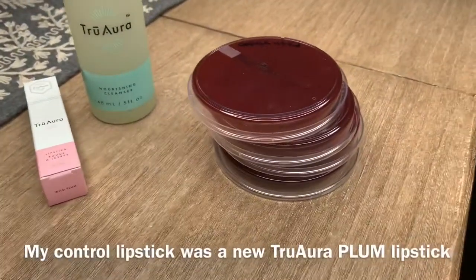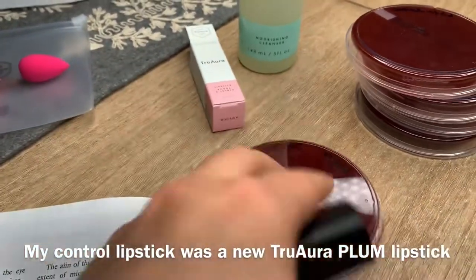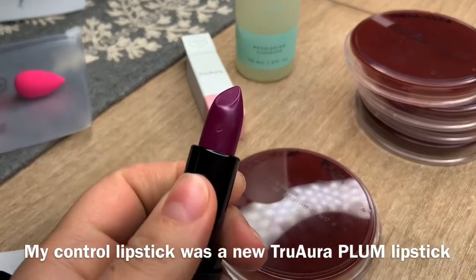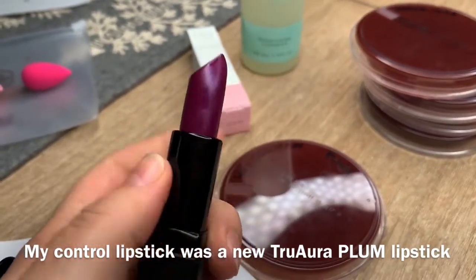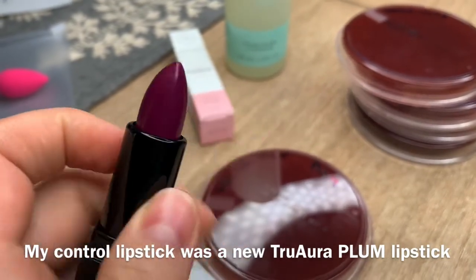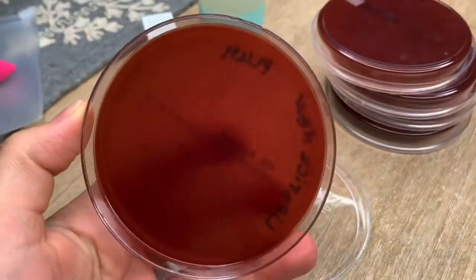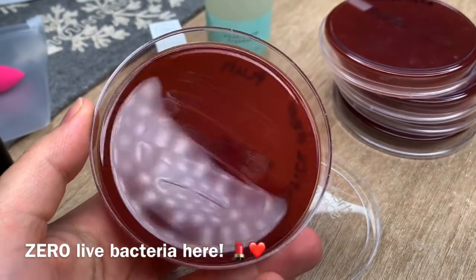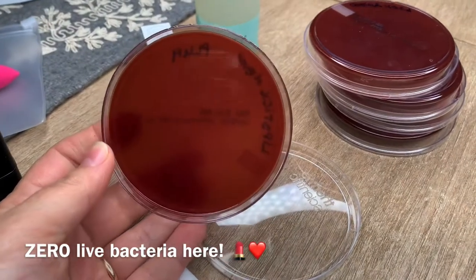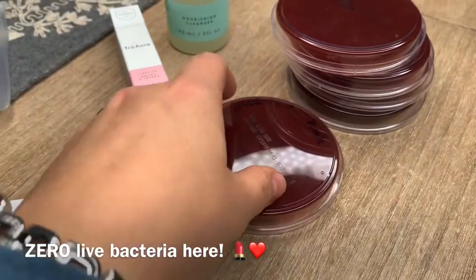As a control, I took another lipstick which I just opened once and tried, but didn't really use. That's how a new lipstick looks like — this is the plum color, a beautiful winter color. And this is how the plate looks: it looks very clean, nothing grows on it, super clean. It's a good quality control — amazing.